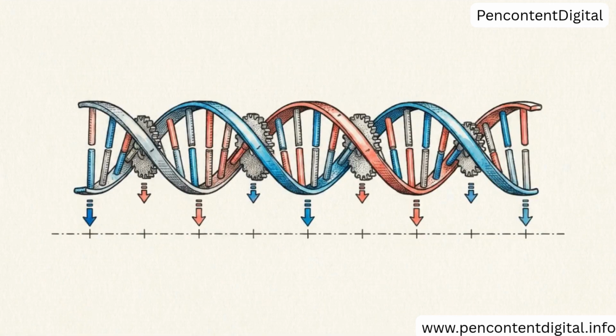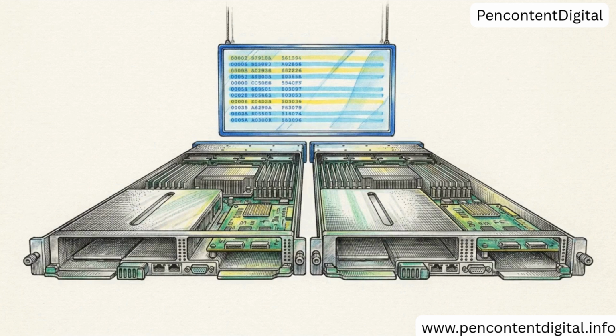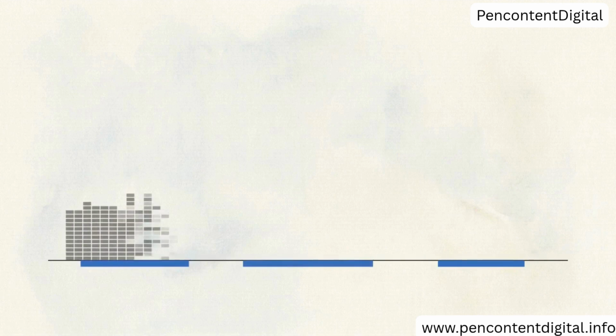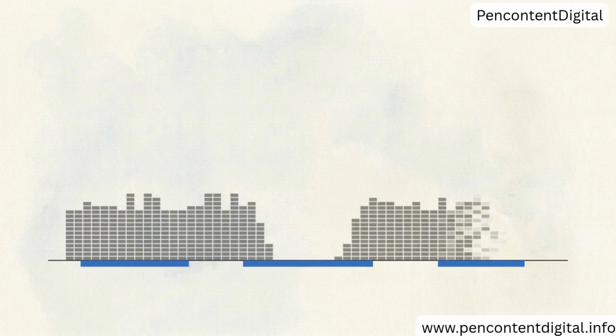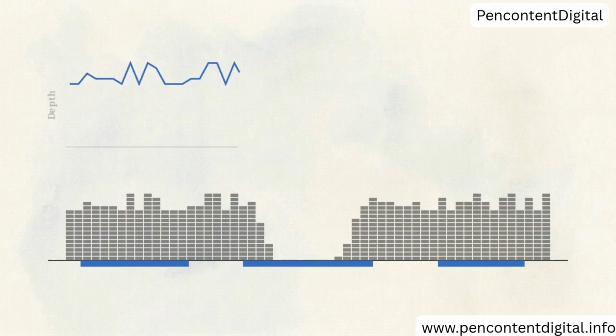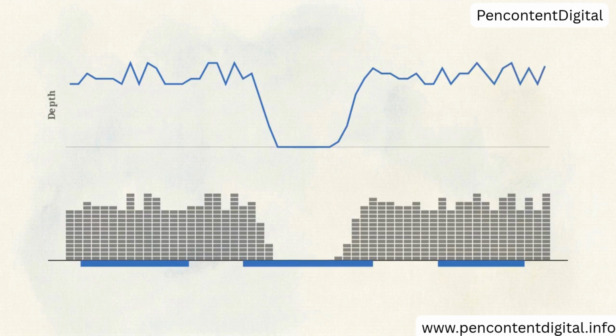After setting the foundation, the actual biological sample reads are mapped against the reference genome. This aligned sequence data is typically stored and loaded from BAM or SAM files. IGV displays these files as stacked read alignments. Each gray block represents a single sequenced fragment of DNA, positioned according to its alignment with the reference. To analyze this data at scale, the software generates a coverage track summarizing the depth of these stacked reads. This line graph tracks the density below.